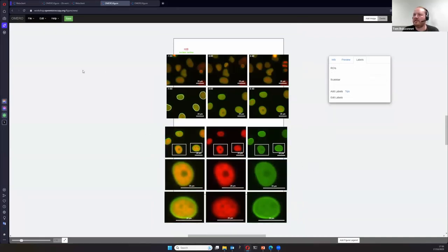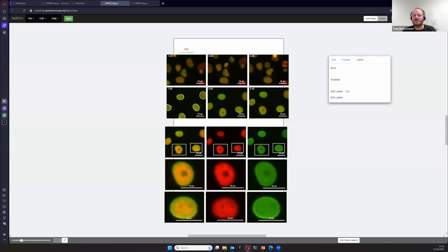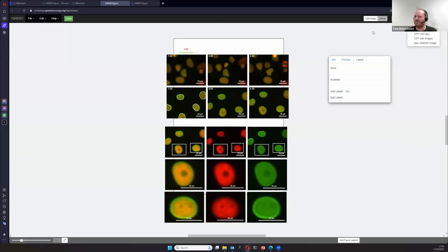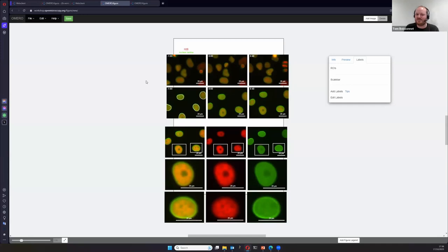If you're working with OMERO Figure, you can save your figure and share a link with collaborators. Can you export the figure as SVG to open in Inkscape? You can export it as PDF or TIFF. With PDF it's a sort of SVG format, and you can edit the PDF in Inkscape, giving you access to all the tools available in Inkscape. OMERO Figure itself is limited to the main functions biologists need to display figures and make montages of their images — it's nothing close to all the functionalities of Inkscape.